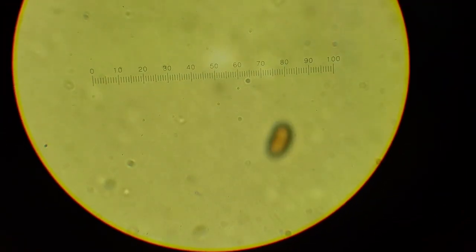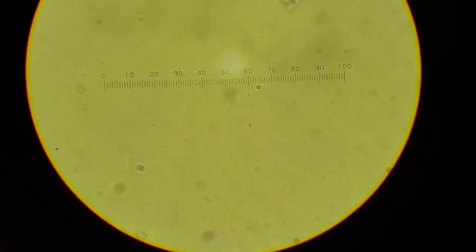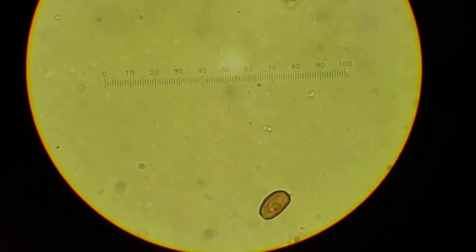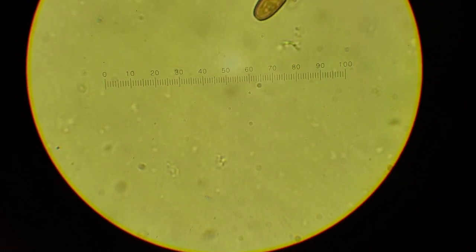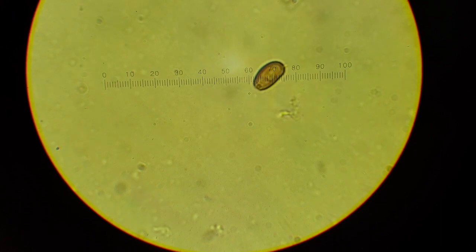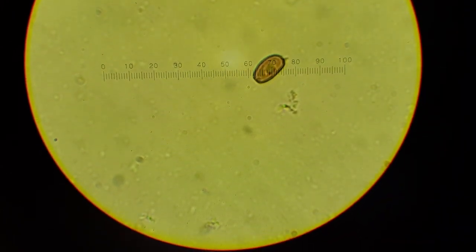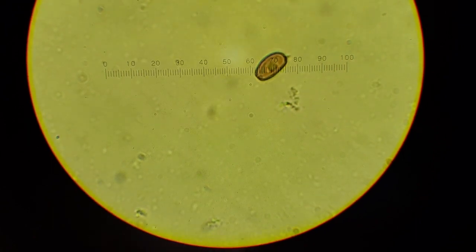There won't be too much water. There won't be too much Brownian motion. So you'll be able to make your measurements as needed. So that's basically how you would section gills and get spore measurements.